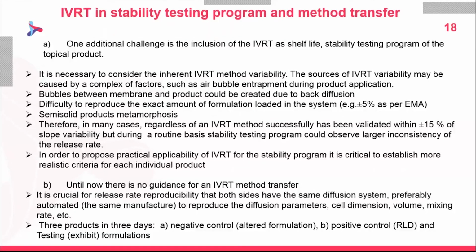Now, briefly, I would like to highlight some of the critical points relating to the stability program and IVRT method transfer. One additional challenge is the inclusion of the IVRT method in a shelf-life stability program for a topical product. It is necessary to consider the inherent IVRT method variability.